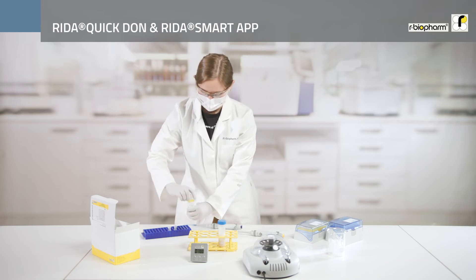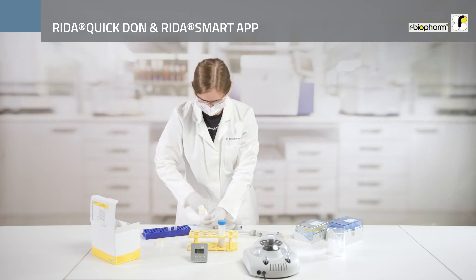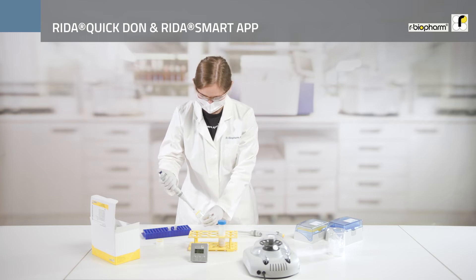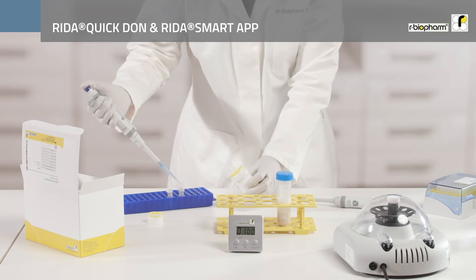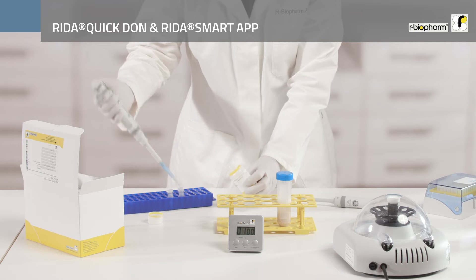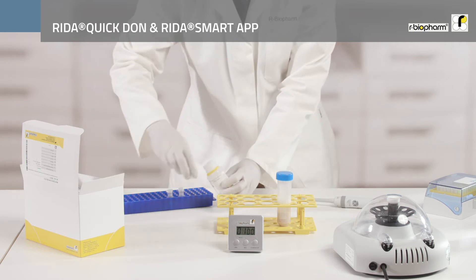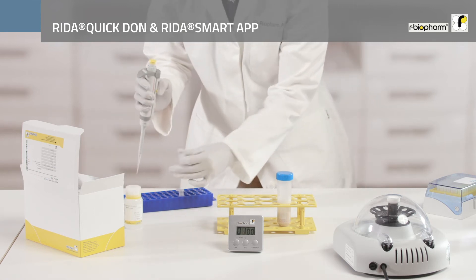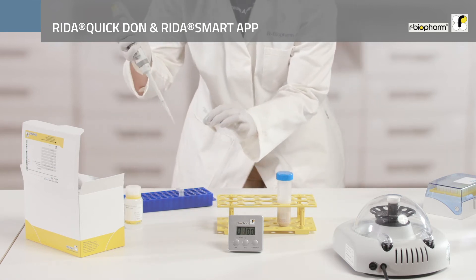In the last step, prepare Dilution 1 for the lower measuring range of 0.25 to 7.5 ppm. To do so, pipette 100 µl of the particle-free supernatant into 500 µl of mobile solvent and mix the sample by inverting the tube several times.